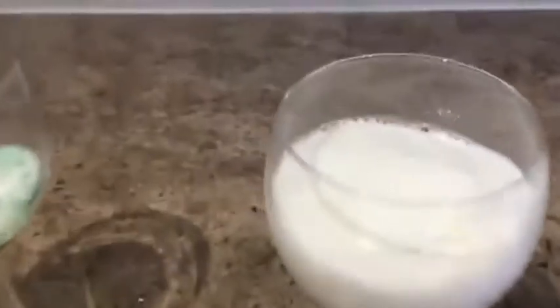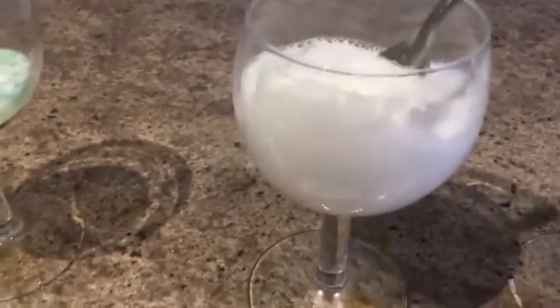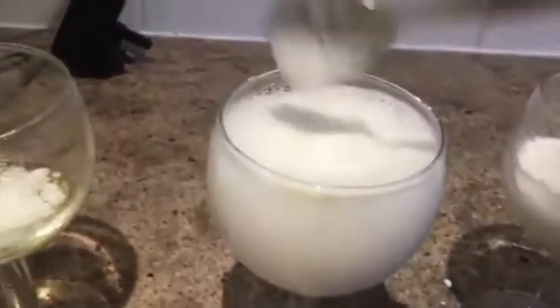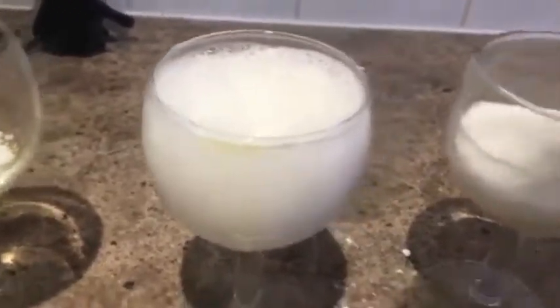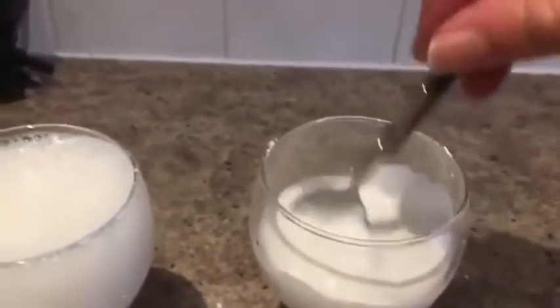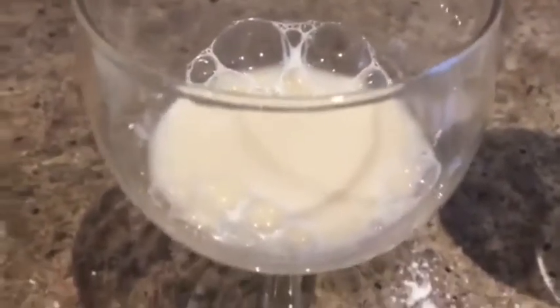But then we've got quite a big reaction from the shampoo, which is almost creating a foamy texture. And again from the baking soda, which is strange. I think this is actually bicarbonate of soda with water in. But yeah, and we've got some from the milk as well. The majority of these are just kind of settling, but the vinegar is still fizzing quite a lot.